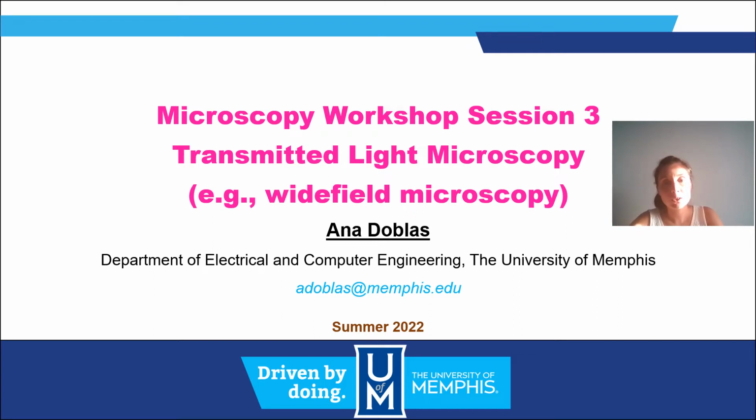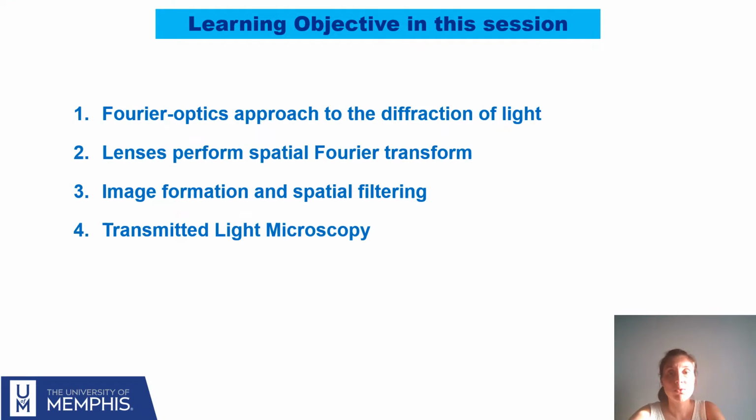Everyone, welcome back to the third session of this workshop. This session is about the widefield microscope. Before talking about that, let me tell you the learning objectives of this session.